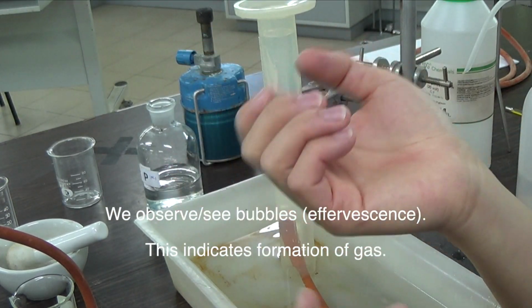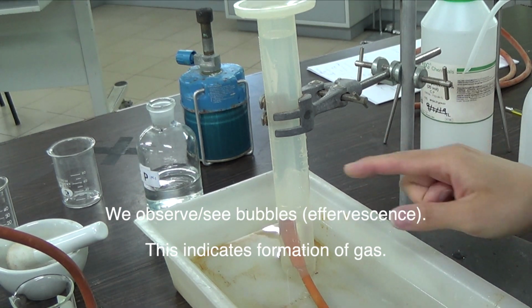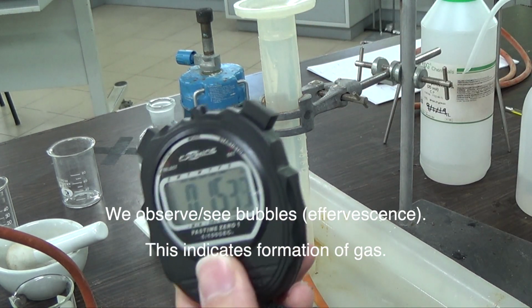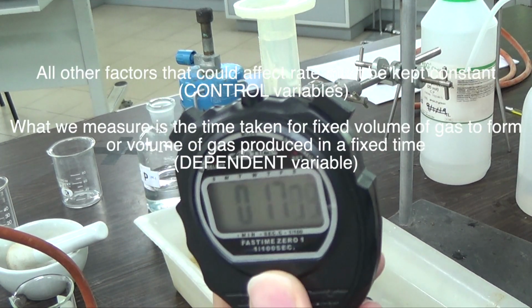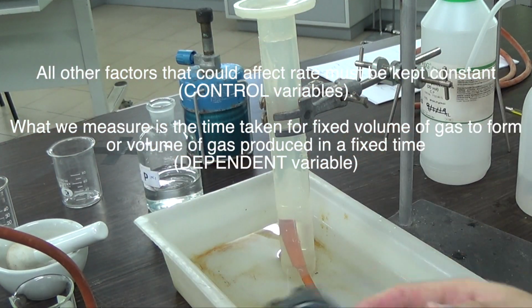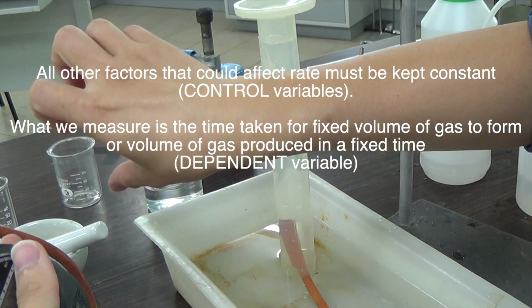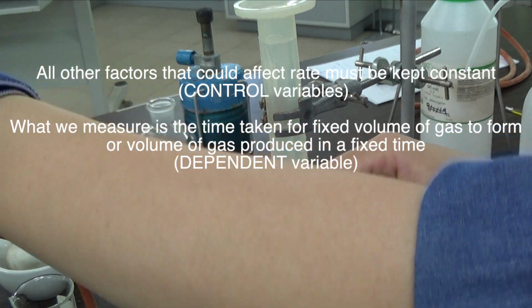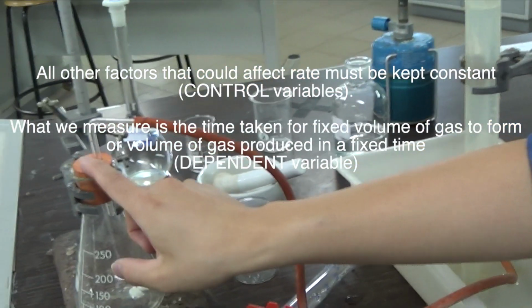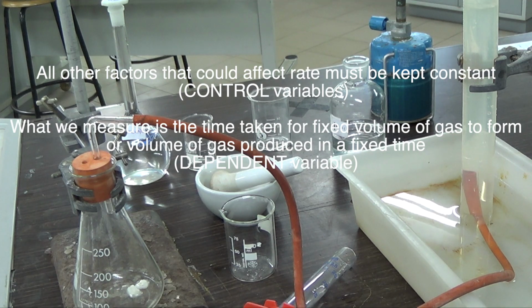But humans, very difficult to multitask, okay? Some experiments will ask you to count the bubbles. Some experiments will just ask you to record the volume of the gas after a fixed time. By right, again, I should have started timing the moment I added in the acid, but being human, one hand controls the amount of acid that you're adding from the measuring cylinder. Your other hand controls the airtight rubber bung that you put on top of the gas collection apparatus. So you don't have another hand to click the stopwatch and start the experiment.